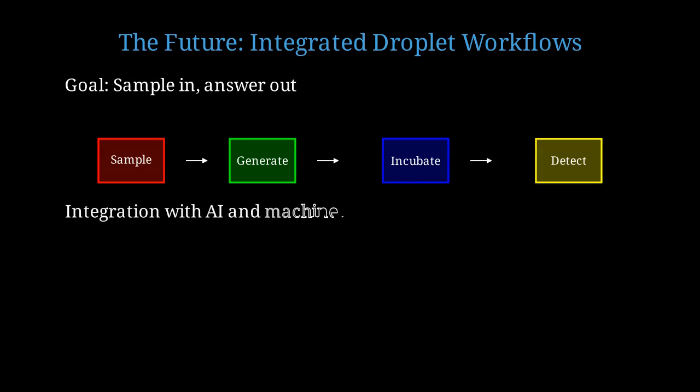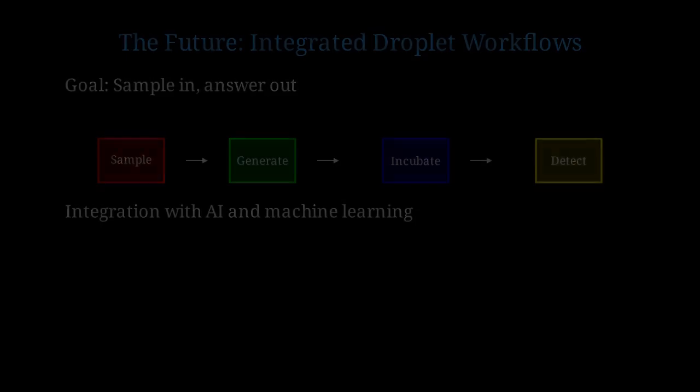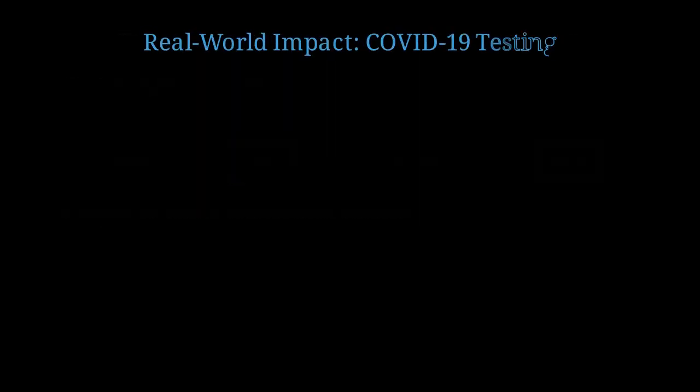We're also seeing integration with artificial intelligence and machine learning. The massive datasets from droplet screens are perfect for training predictive models. Let me give you a real-world example of impact: Droplet Digital PCR for COVID-19 testing.